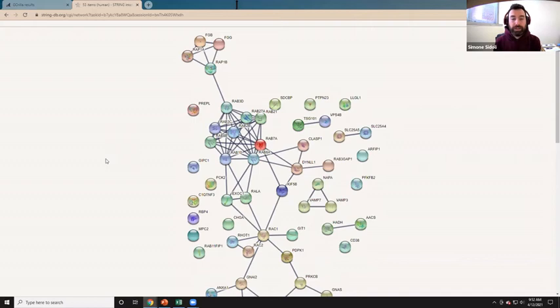If you're wondering at the end of your proteomic experiment, what should I do next? What I would do, for example, isolate from my cells extracellular vesicles, or for example, analyze the proteins that are secreted by my cell upon the treatment to find out, okay, these proteins that are involved in transport, they seem to be so upregulated. What are they transporting?